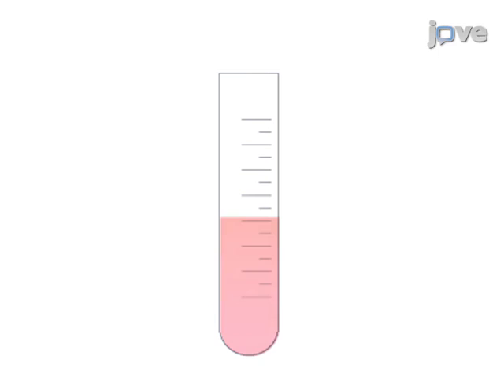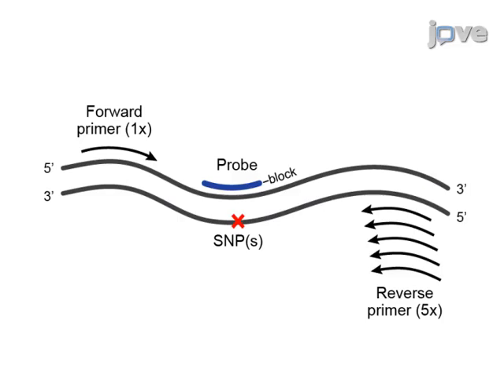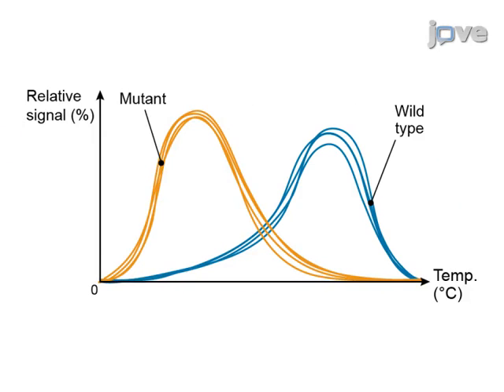The second step is to prepare the assays with asymmetric proportions of the forward and reverse primer to increase the template probe product. After preparing the reactions, the annealing temperature is set between the melting temperatures of the probe when bound to either the wild-type or mutant template. The final step is to analyze the amplified products on the appropriate HRM platform.